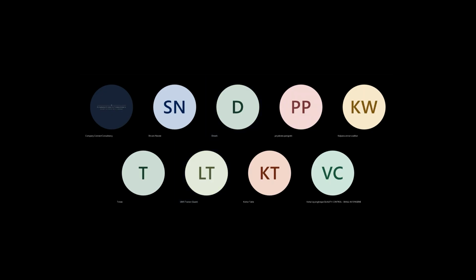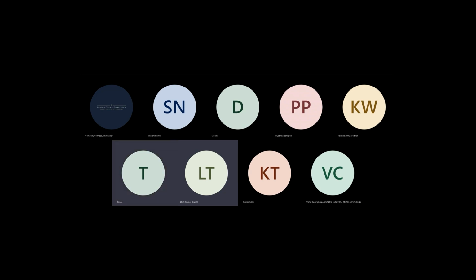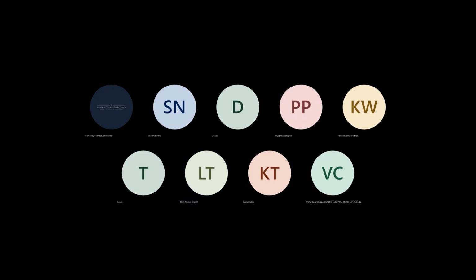We'll cover stability management, instrument management, query management, and inventory management. Your screen is not visible, sir. No, I'm not sharing my screen. I'm just telling you the topics. We'll also see a bit of master data creation.